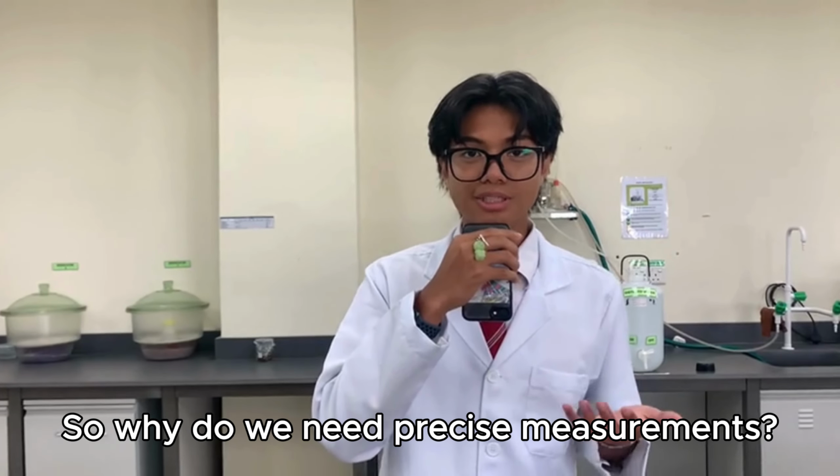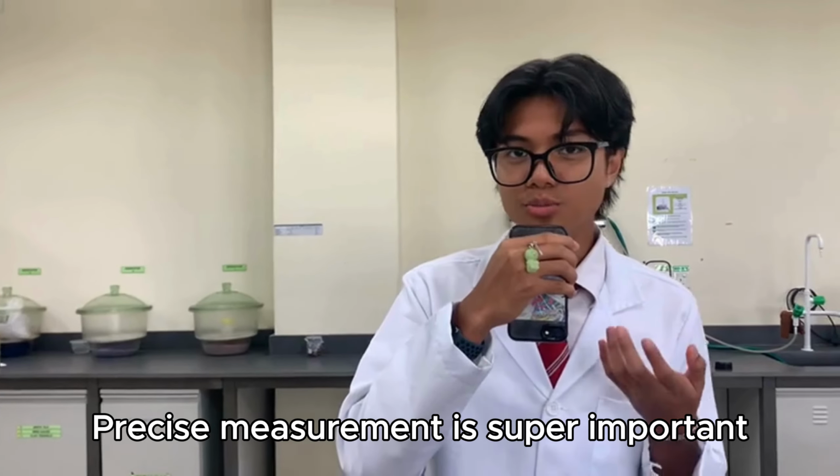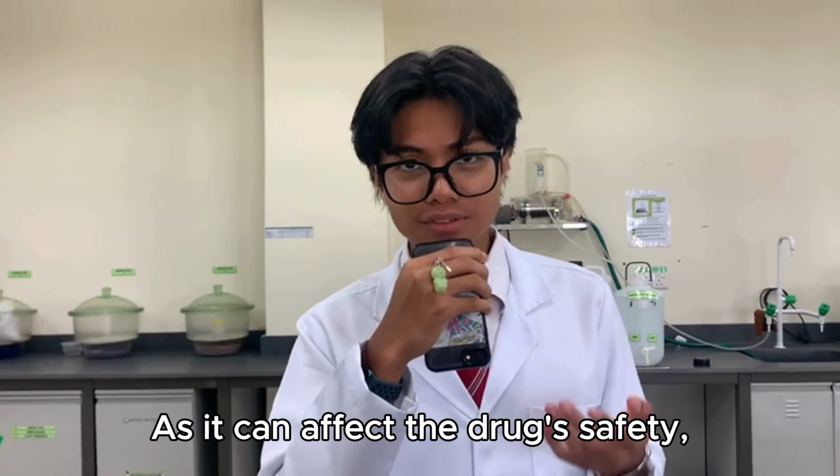In this video we'll be talking about the uses of analytical balance and volumetric glassware. So why do we need precise measurements? Well, in a pharmaceutical lab, precise measurement is super important as it can affect the drug safety and also its quality.